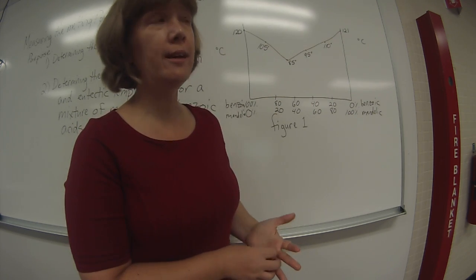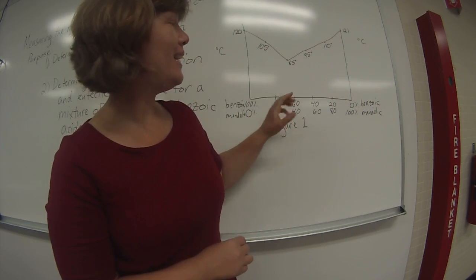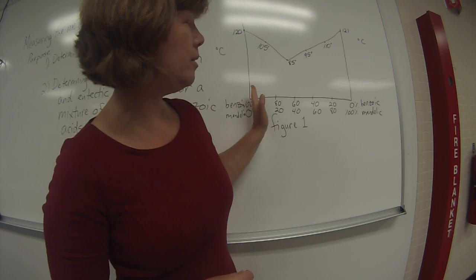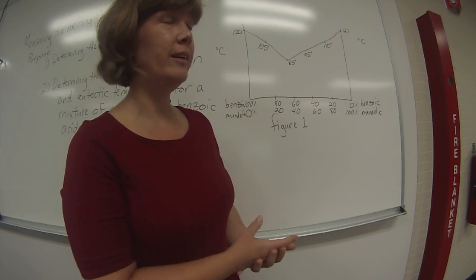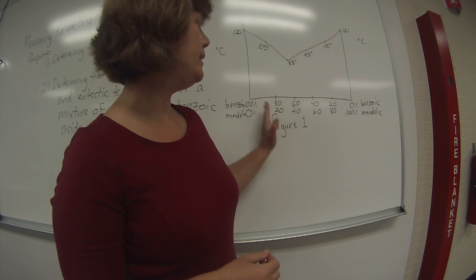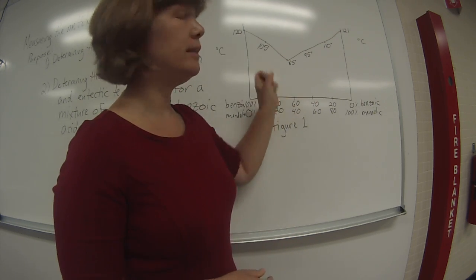The composition of this mixture that has the lowest melting temperature is 60% benzoic, 40% mandelic, and so that composition is the eutectic composition. Now, we only took melting temperature ranges for 4 mixtures, so this data is not very precise. In order to know more precisely the eutectic temperature and the eutectic composition, you would need to measure many more mixtures, but in this experiment there's just not the time, so we get this approximation.